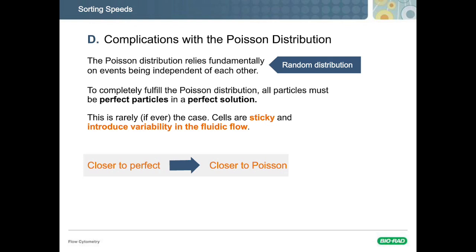And of course, that's related back to doing a purity sort. If you're doing an enriched sort, it isn't nearly as important, unless you're trying to maximize the purity of your enrichment, in which case you come back to exactly the same problem. You're trying to pick how fast you need to be running this versus how much sample you're willing to lose.